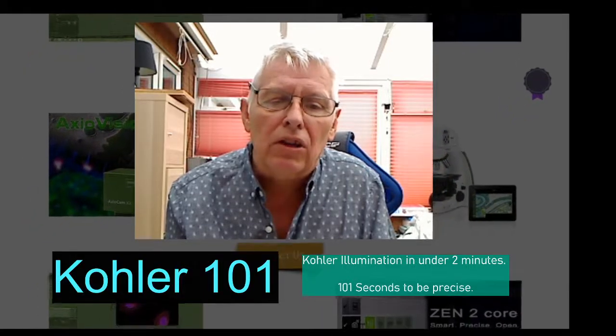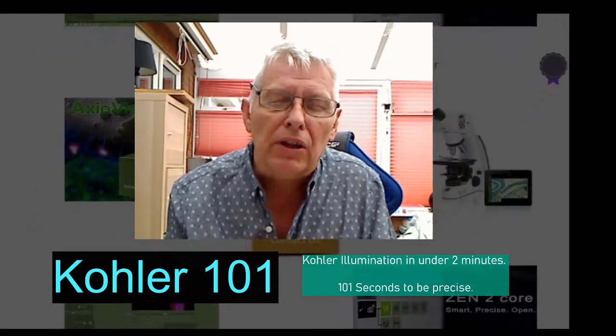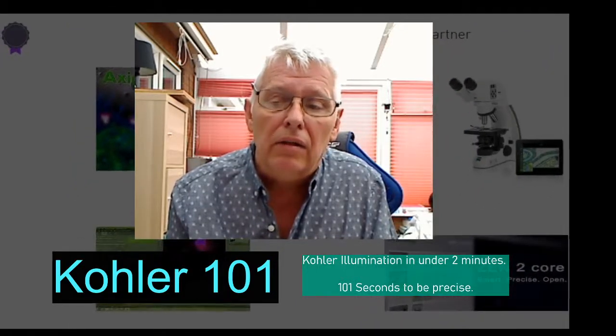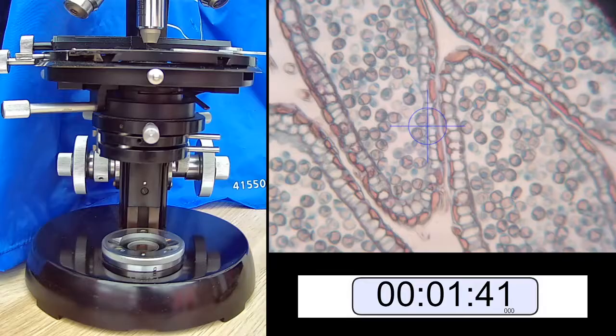Here we're going to talk about Köhler in under 2 minutes, so I'm going to speak quickly. More detail is available on other videos in the site. But let's have a look at this. So let's start the timer.